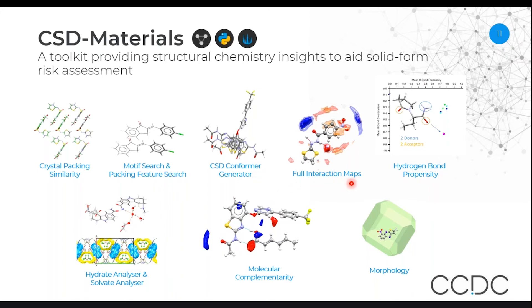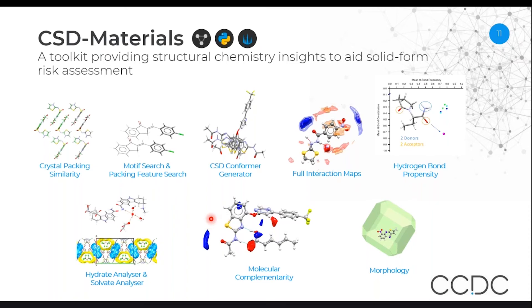We have full interaction maps, which use statistics from the database in order to see where the most likely sites of donor and acceptor atoms in your structure are. We have hydrogen bond propensity, which is one of our most impactful tools in terms of drug solid form risk assessment, used to identify potentially more stable polymorphs.